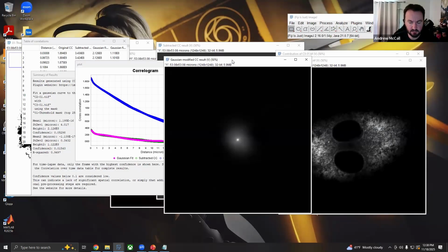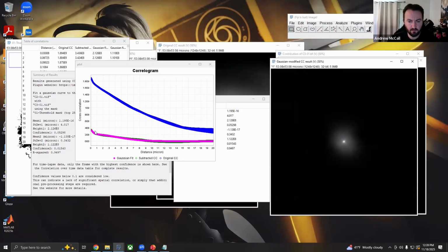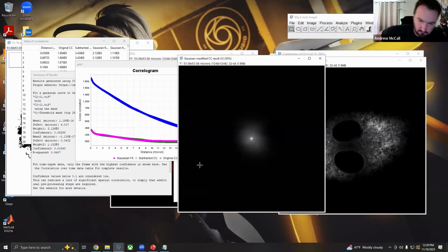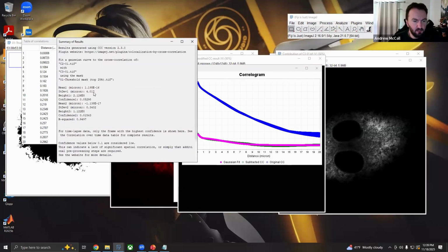And honestly, the reason I say that this is insufficient resolution, we do get that narrow band result, but this low frequency probably shouldn't be here. And that's why I say I think there's insufficient resolution with this data, because realistically, especially given that this is supposed to be within the mitochondria or endoplasmic reticulum, we shouldn't be getting that broad signal, especially with an appropriate mask. So just something to think about when you're analyzing your data. Make sure that your results obviously make sense.